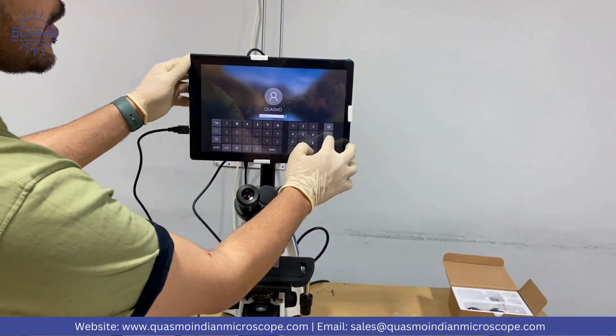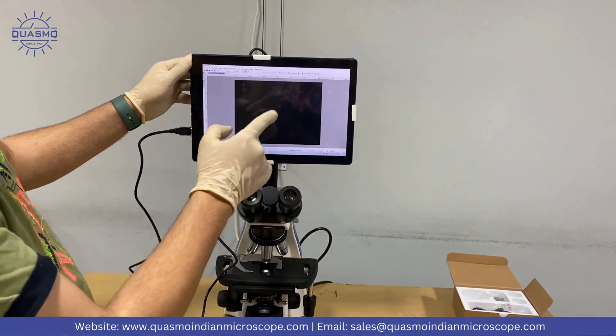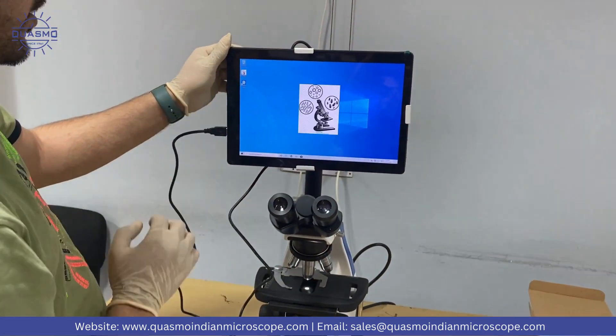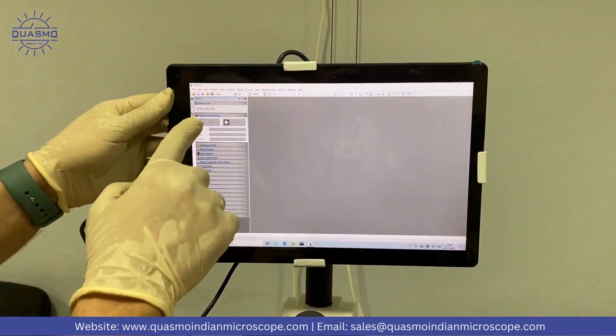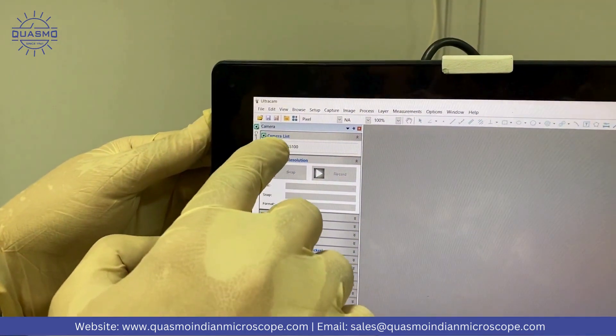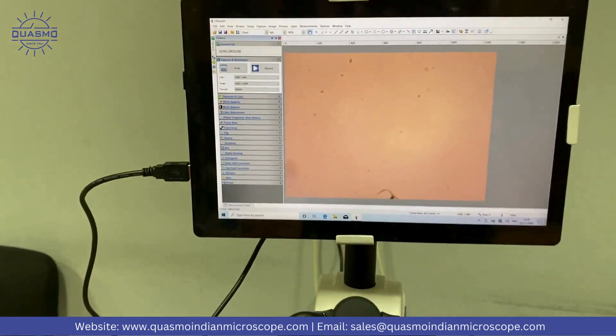The tablet PC will be password protected, and the password is 1-2-3-4-5-6-7-8. We'll open the camera software, and we'll see our camera model number written here. Just click on the model number and we need to focus this light.